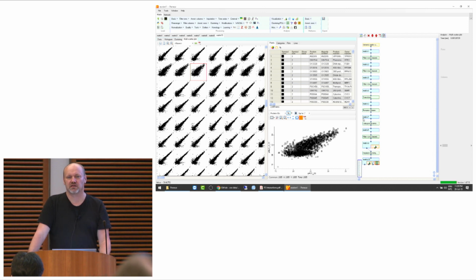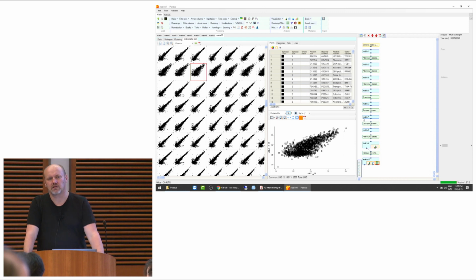Yes. As opposed to a pull down, suppose they were doing an organelle isolation, plasma membrane or something like that, and they have contamination from the rest of the proteome in a few samples. Then you would just want to find those on a gel and throw them out and not include them. But if they got into your data set and ran over your column and everything, you'd get a very narrow dynamic range in some, and a much broader dynamic range for the others, but lower count. So you'd normalize over the whole data set.